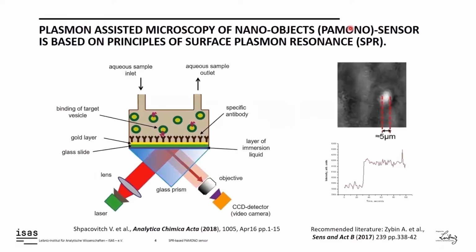And now I would like to describe the theoretical basis of plasmon-assisted microscopy of nano-objects. This is an SPR, surface plasmon resonance-based technique. On this slide is presented the most common scheme of the surface plasmon excitation.